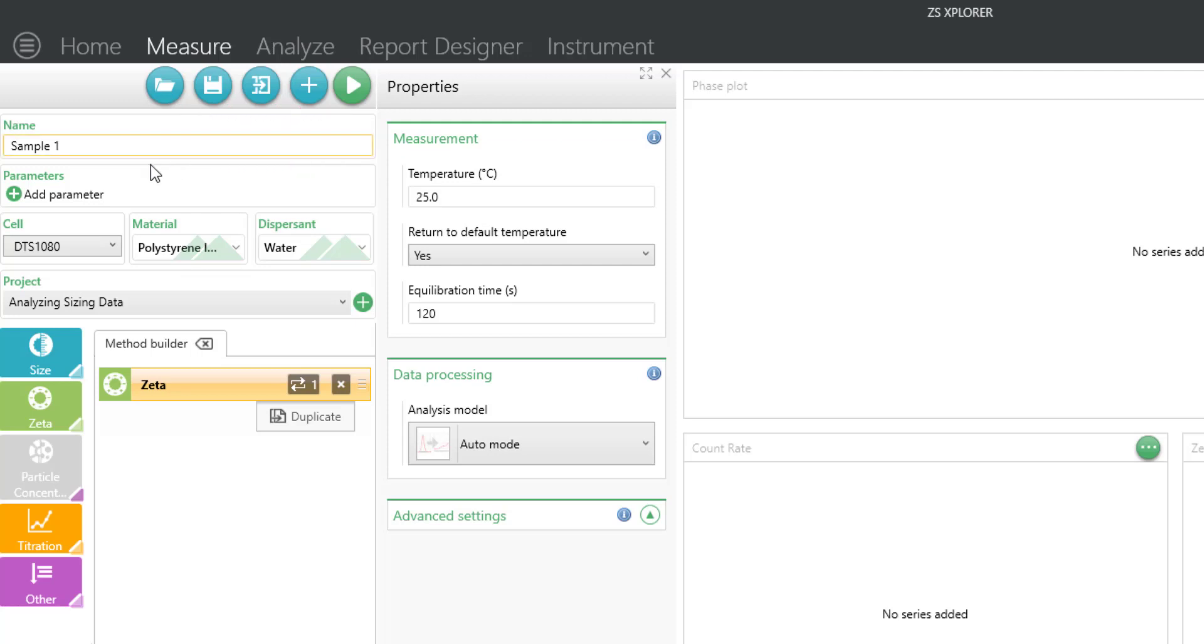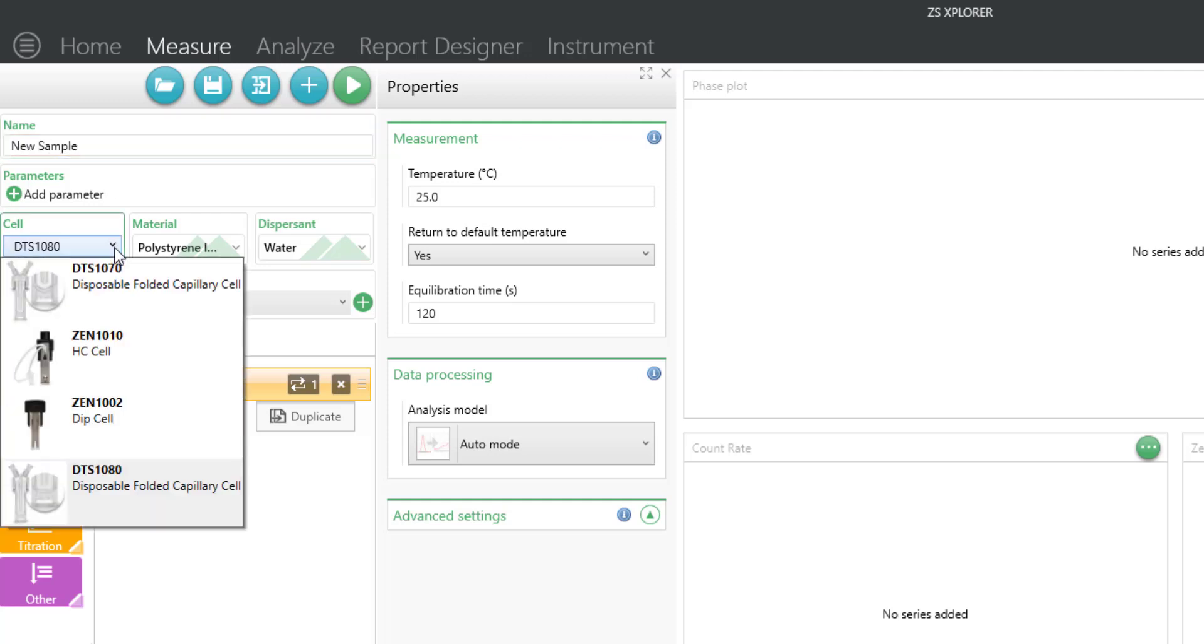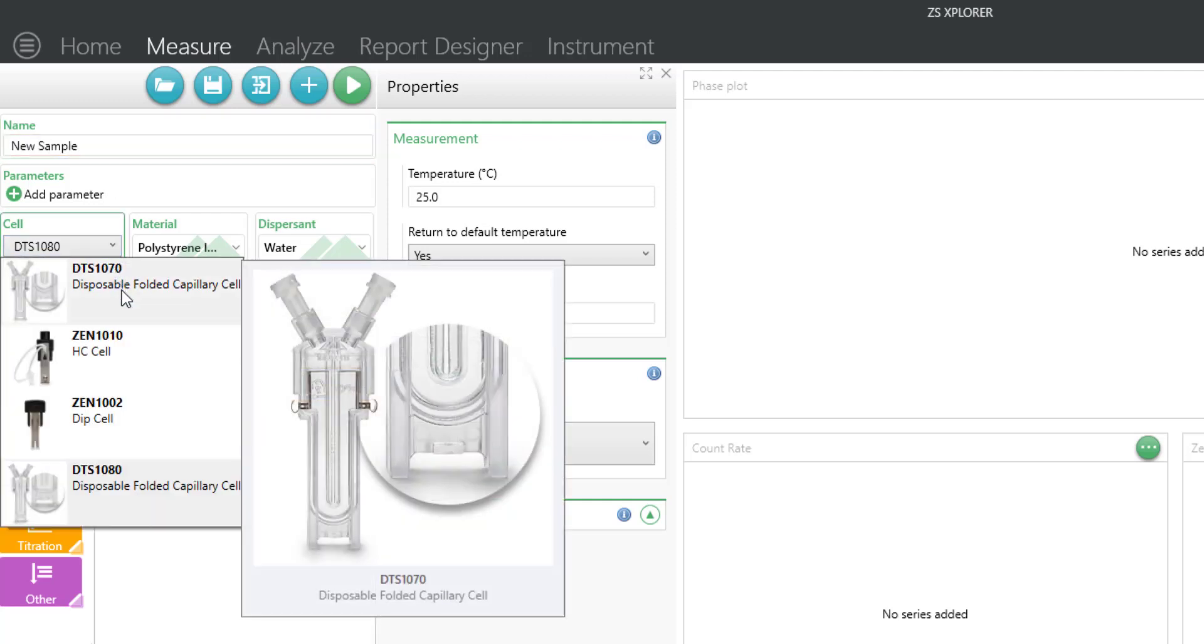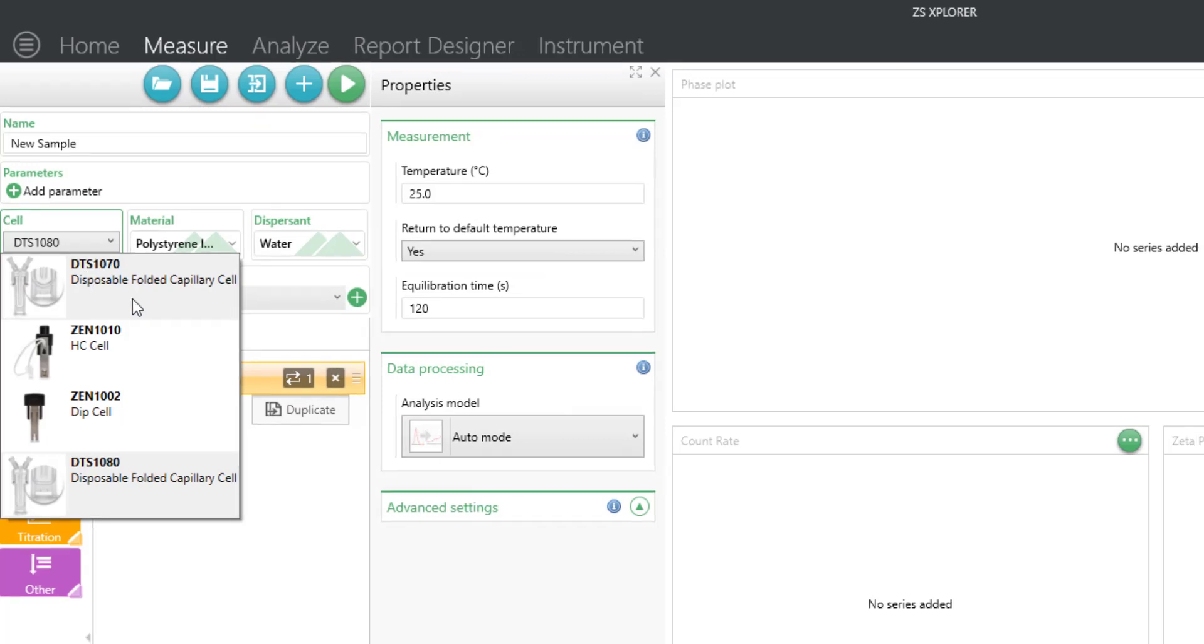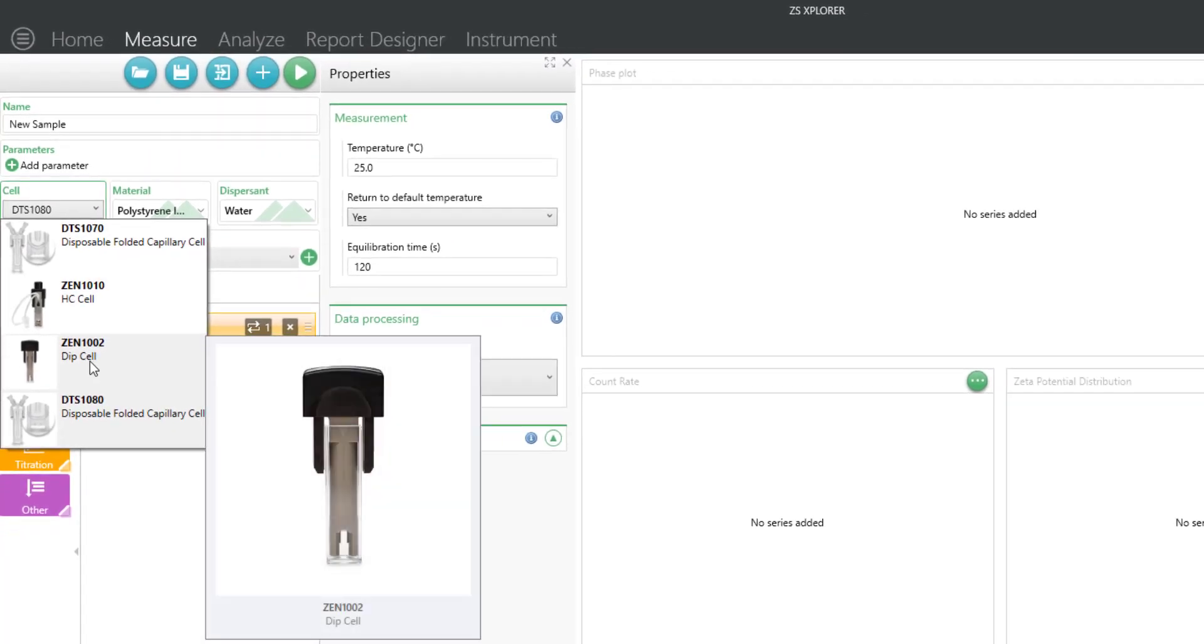To start a method, first type in the sample name, then select the cell type. The most common cell for zeta potential is the folded capillary cell, such as the DTS 1070. This is primarily used for aqueous solutions.